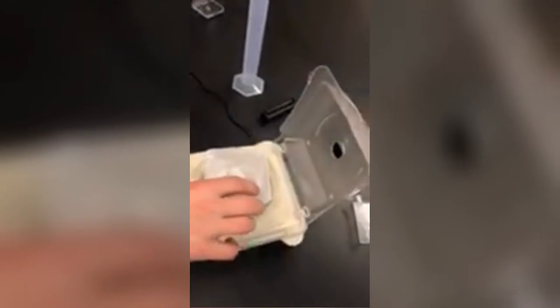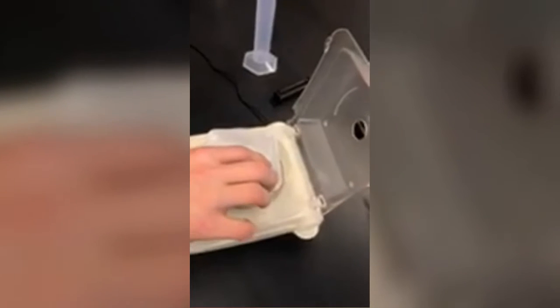The scale would work. Like 0 it. You get 0.4 grams.